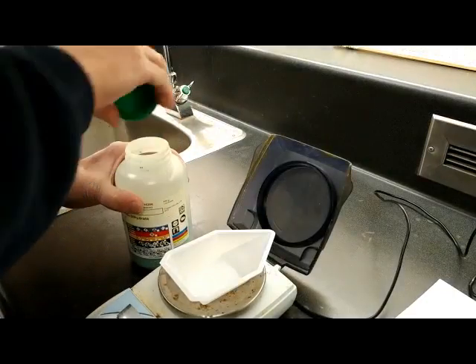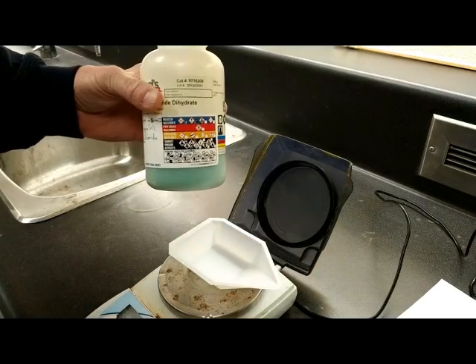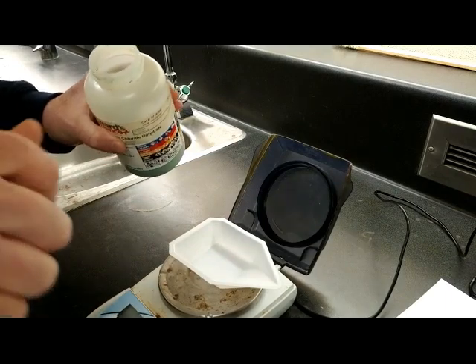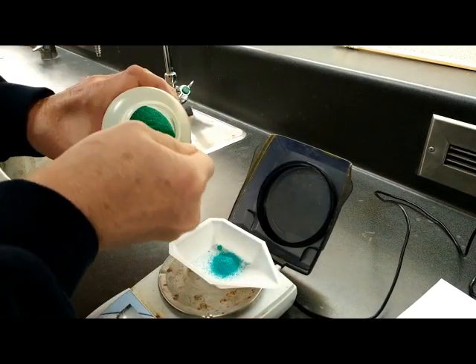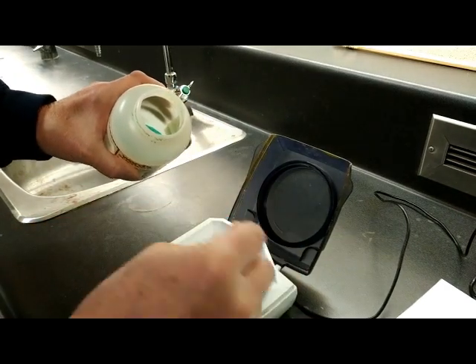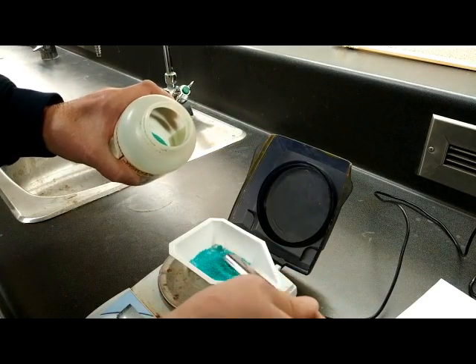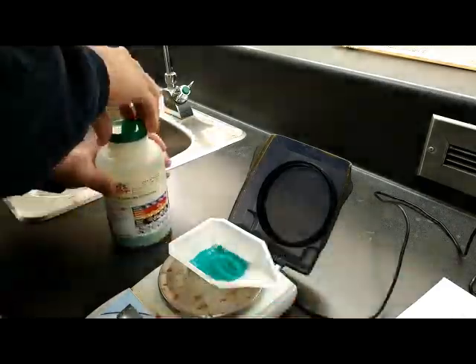Okay, so we are going to, first of all, measure out the correct mass of the copper-2 chloride dihydrate. Now you'll notice that you can't see the numbers down here off the screen, and there's a reason for that, obviously, because you need to calculate that in your pre-labs, and we're going to add twice as much as what we're supposed to calculate. A little more than... okay, so there's the correct amount.